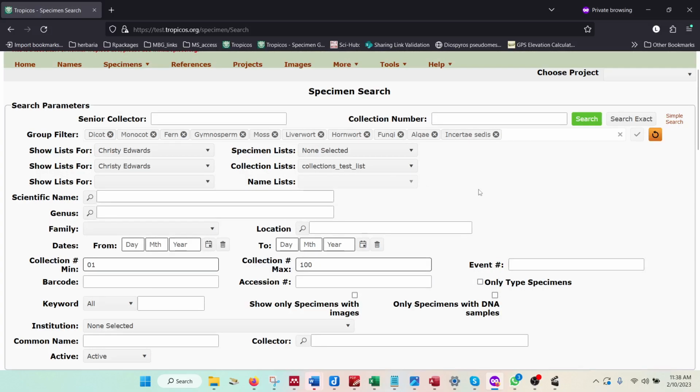So yeah, we might put out another video going over collection events search and stuff like that. But the average user won't need to worry about collection events.